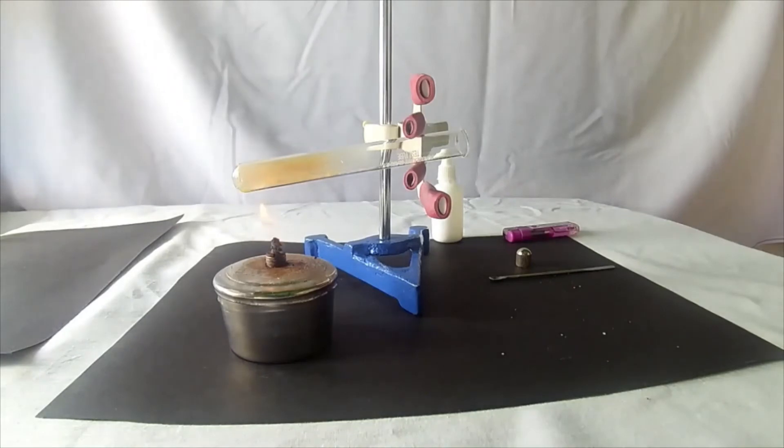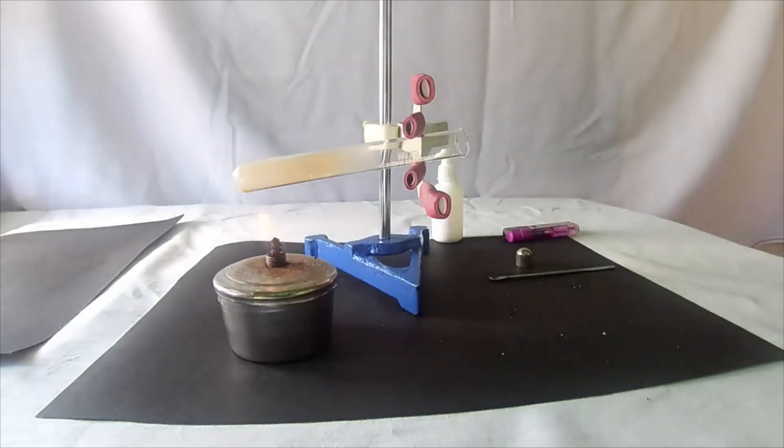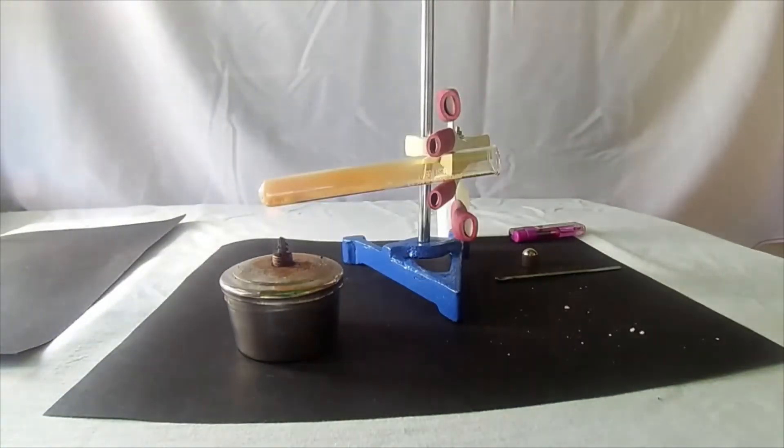Now we can see a reddish brown color gas. This is nitrogen dioxide. When lead nitrate is heated, nitrogen dioxide gas is evolved. See the reddish brown color. This is nitrogen dioxide.